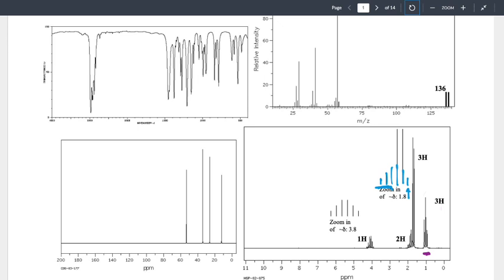Okay. That CH3 is bonded to something. The next thing it's bonded to has to have 1 hydrogen connected to it. So there has to be something out here. If I make it a hydrogen, why is that problematic? If I draw a hydrogen right here, it closes the structure. I wouldn't be able to continue out. And it would be an identical hydrogen, so that doesn't work. So there has to be an intermediary atom.